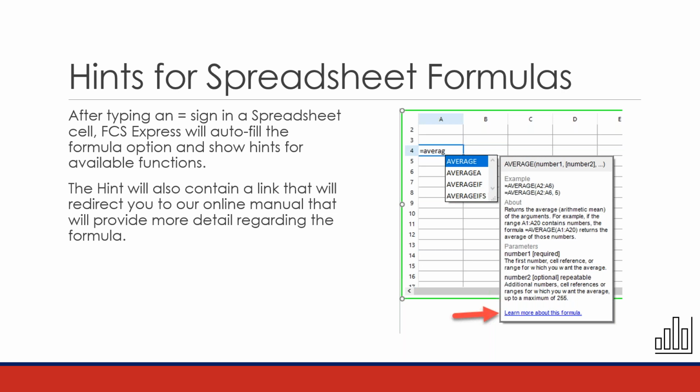If anyone uses Excel, you're probably just a passing user, not that much of an expert. You basically know what you know, but outside of that, you wouldn't know what to do if you need to select another formula. So we've added these rather detailed hints directly into the spreadsheet that use a lot of the same functions that you would find in Microsoft Excel.